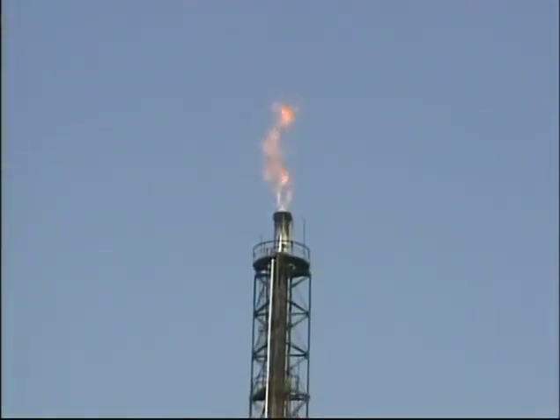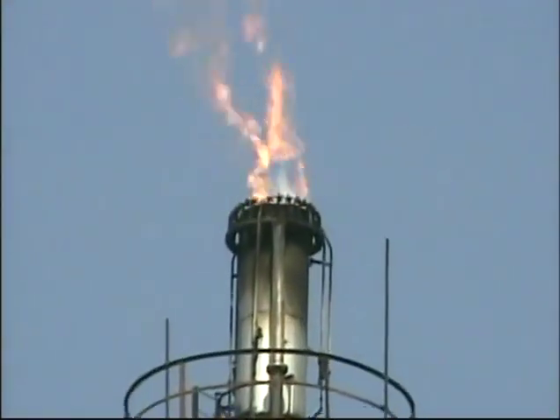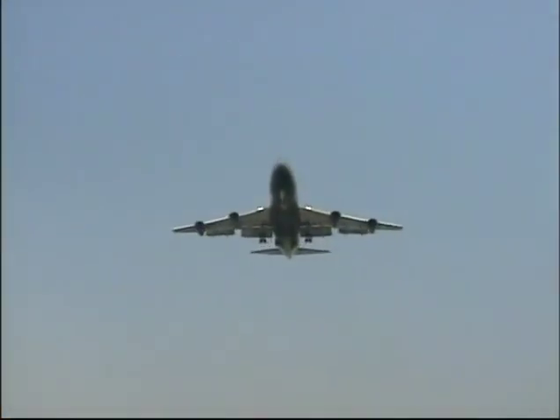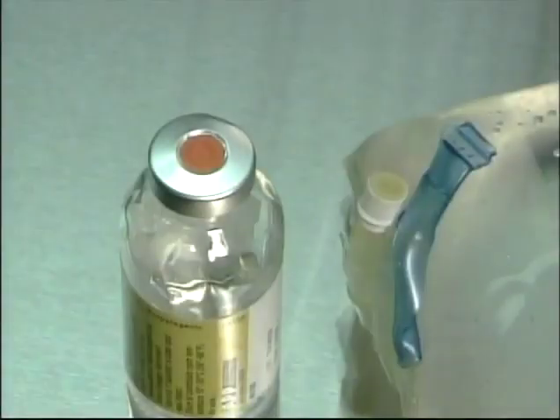Particulate matter consists of general environmental particles of smoke, dust, hair, fragments of glass produced when ampules are opened, and small cores of septa material which may be punched out when the hypodermic needle penetrates septa and additive ports.